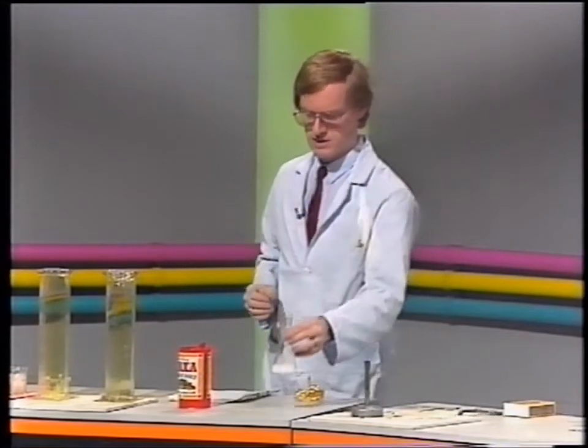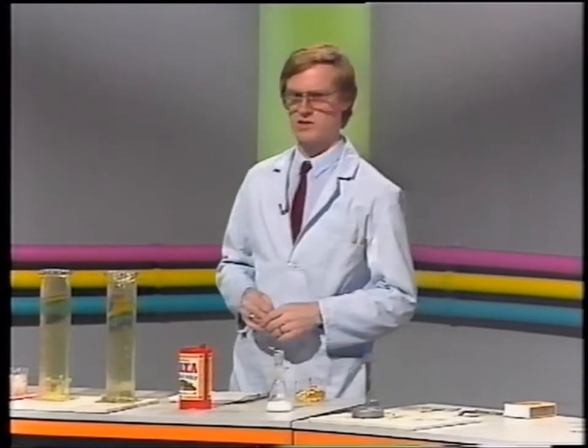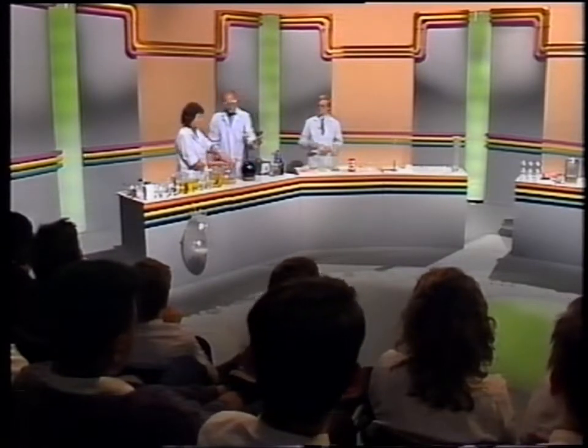Now, this gas is particularly soluble in water. It's very, very soluble in water, and one experiment that we can show you to demonstrate that is sometimes called the fountain experiment. And Anne and John are going to demonstrate this now.